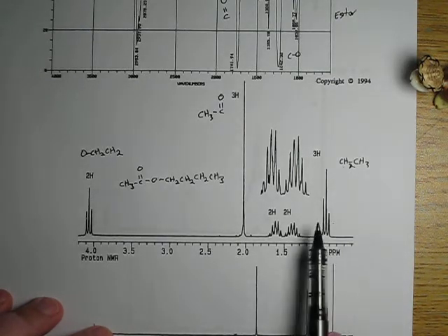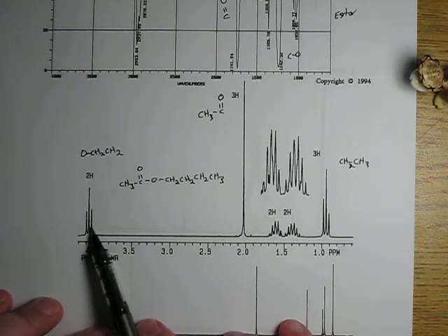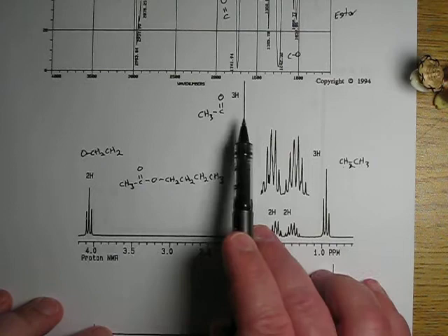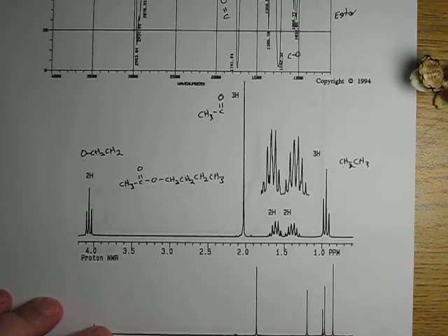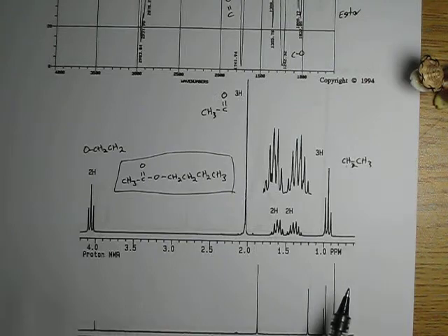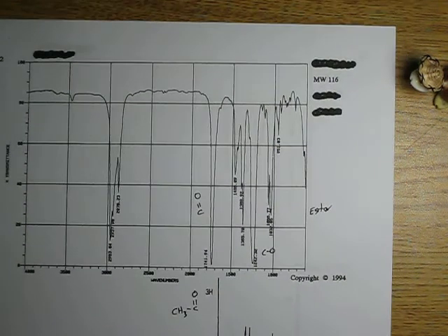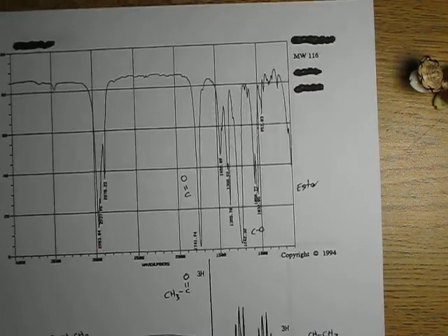Let's double check. How many CH2s? 1, 2, 3 CH2s. I got that from the integrations. 2 CH3s. We got my carbonyl in there. And if you were to add up 12 for carbon, or the mass of the carbons and the oxygens and the hydrogens, you will find that this goes to 116. Phew. Well, we've got 2 more to go.